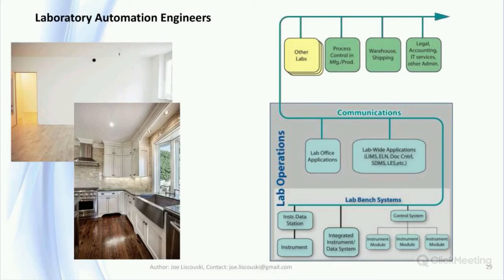The relationship between lab automation engineers and corporate IT groups is a lot like that of professional kitchen designers and installers and people who build homes. The construction crews are there to create the structure, divide it into spaces, and provide the needed infrastructure. When it comes to the space designated as a kitchen, what you have is an empty space with some use-specific infrastructure elements: plumbing, power, floors, walls, and a ceiling. The role of the kitchen designer and installer is to customize that space so it can function as a working kitchen. If there are structural problems, the general contractor resolves them.